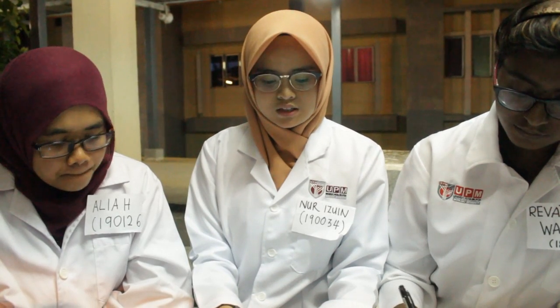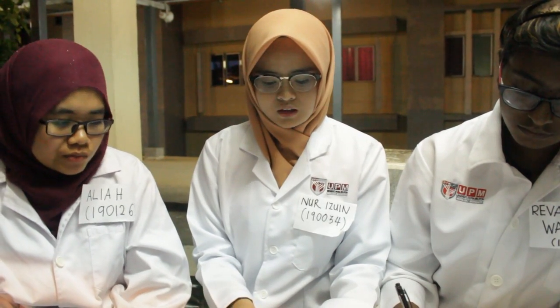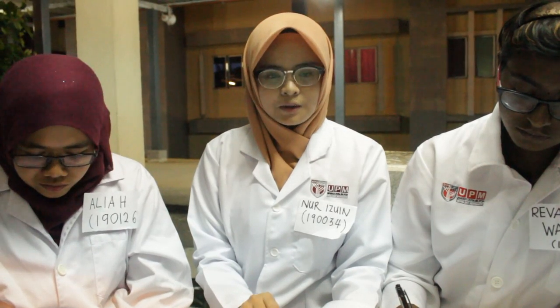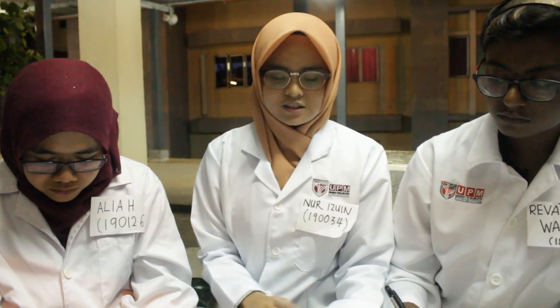Next, I will proceed to the spectroscope. The spectroscope plays a role in selecting a monochromatic light from a visible light source. It includes filter type, prism type, and grating type. Next, the sample cell. The sample cell is a container that contains a sample, usually called a cell. There are 2 types of sample cell, which are glass cell and quartz cell.